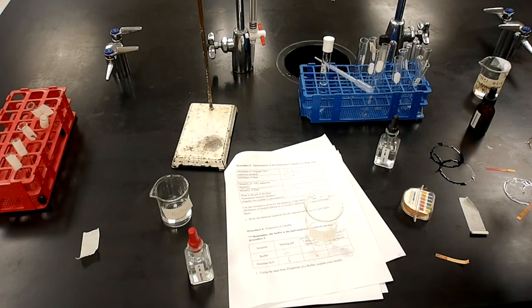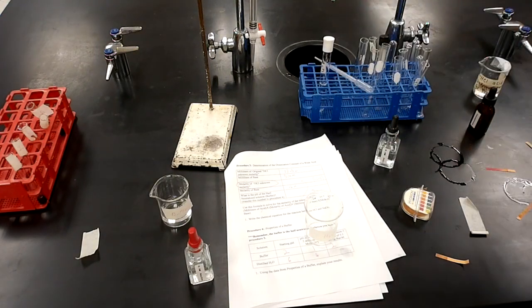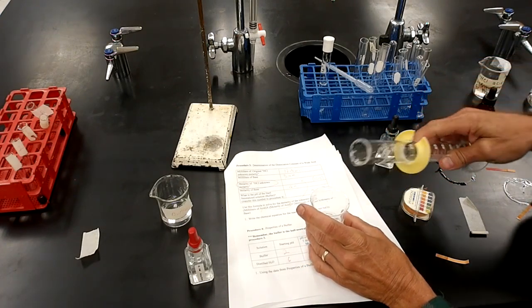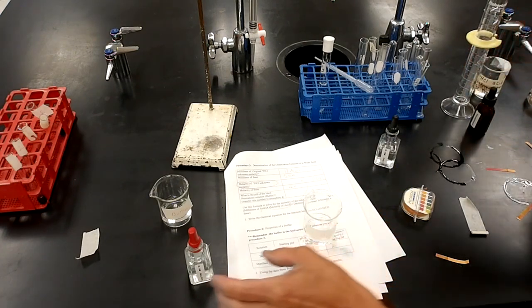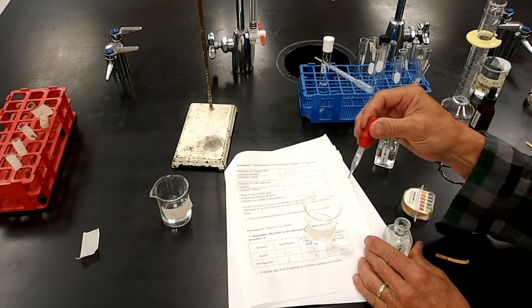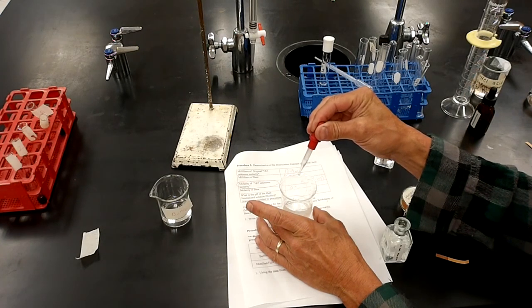I'll measure out another 25 mLs, and add some sodium hydroxide. 1, 2, 3, 4, 5.